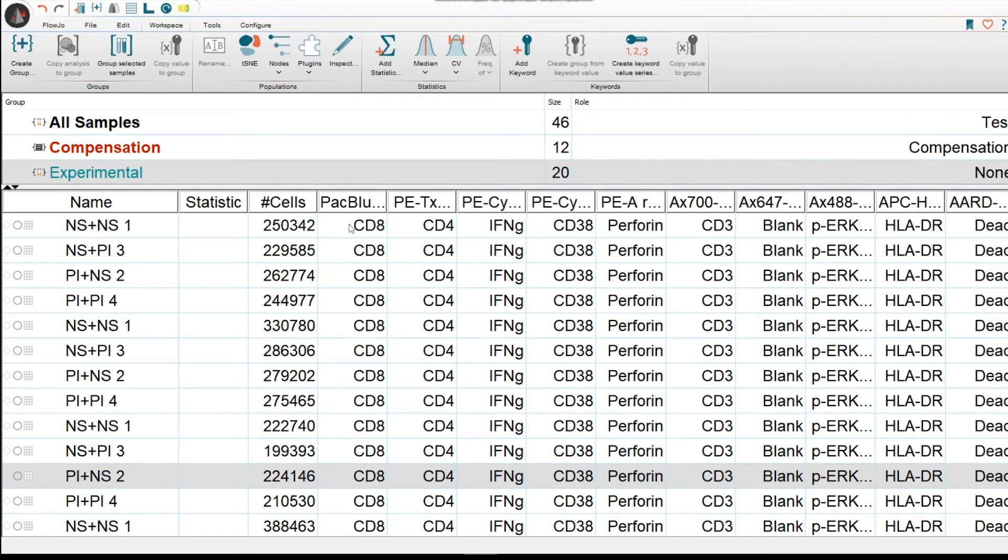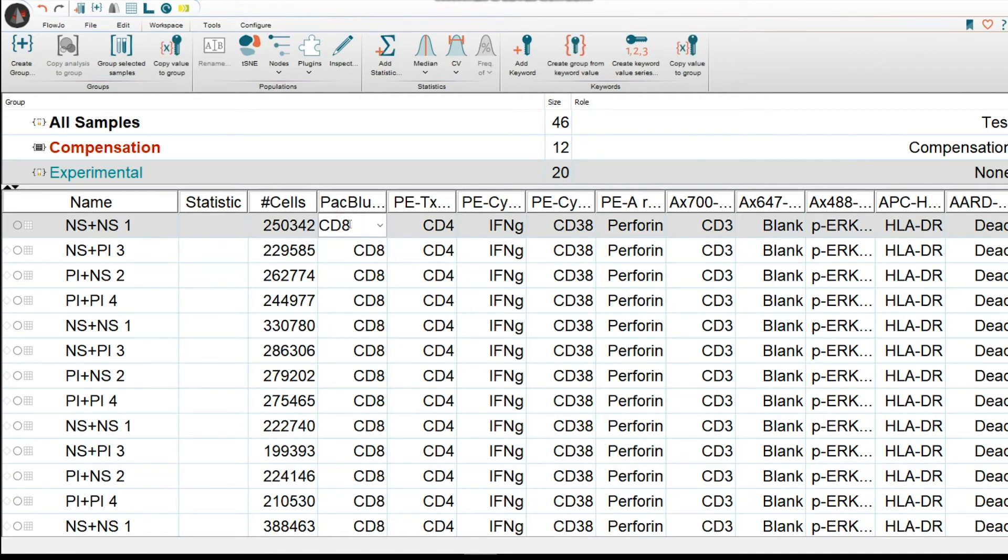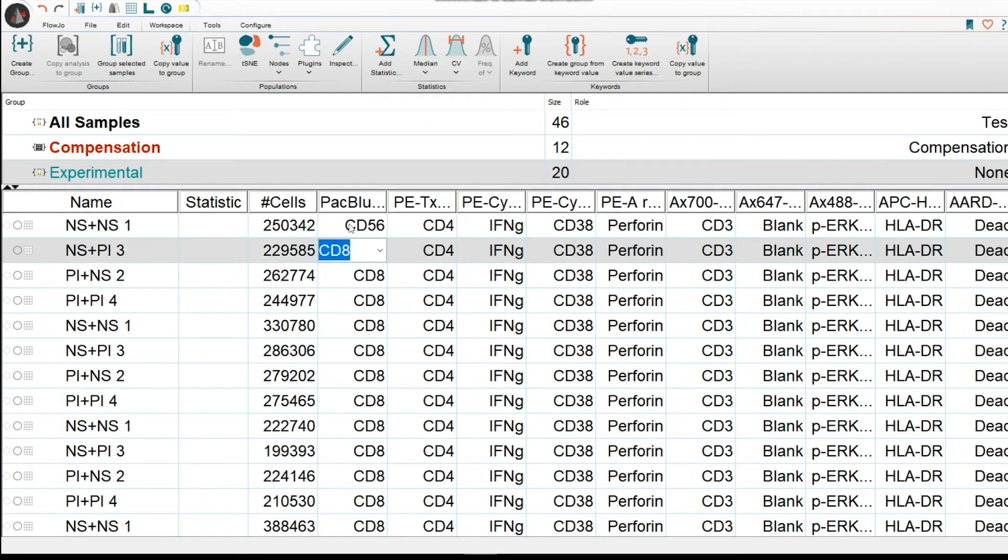You could also copy them. If you don't have them yet, you could always introduce them yourself. For instance, let's say this was not CD8, but rather CD56. I would type in CD56, press Enter, and it is now there.